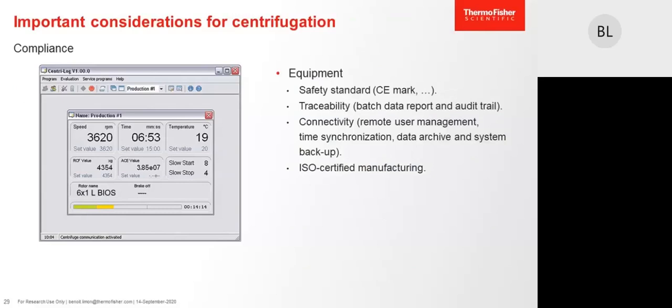For the compliance for the equipment means to comply with the safety standard in place in the country, as well as the traceability of the sample. Usually the software or the equipment will do the batch data reporting and the audit trail to track all the work and all the samples.